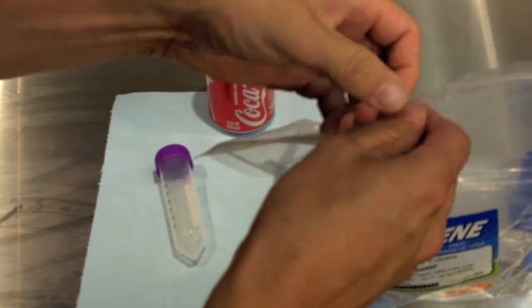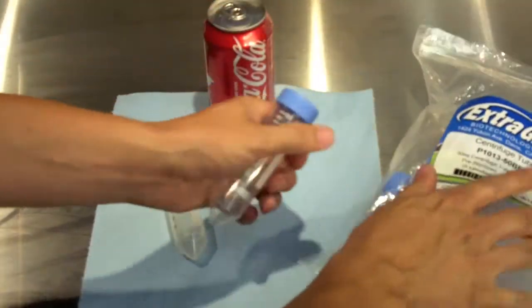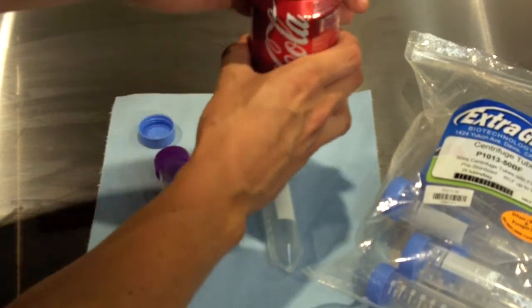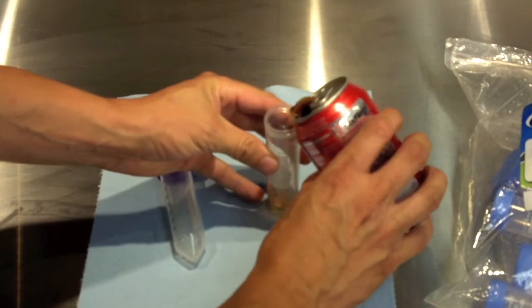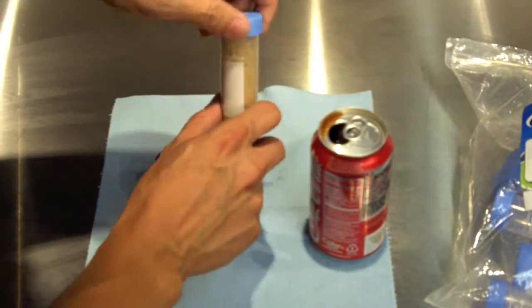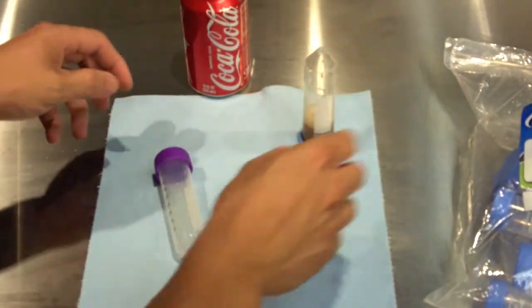So what we are going to do is grab one of my ExtraGene 50 ml centrifuge tubes, open it up, and then open the can of Coke. All you do is simply fill the centrifuge tube up with the Coke, put the lid on, then shake it up, and place it upside down.